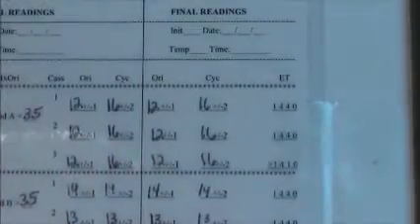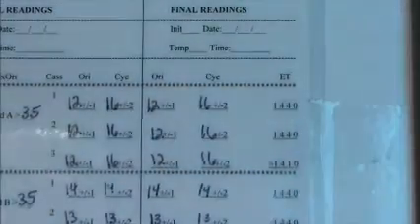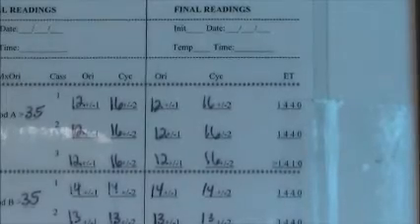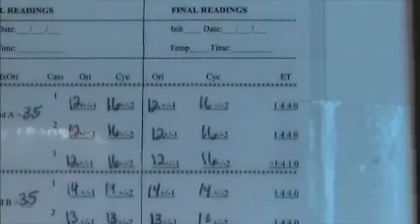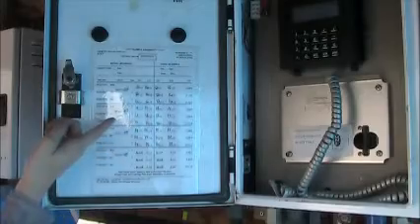Now you can do your final readings. There are 3 values of importance that you will record: ORI, CYC, and ETs. The ORI and CYC values are module specific. Generally, all ORI and CYC readings for a module should be similar. Module specific values should be listed on a sample log sheet taped to the inside of the controller door. If the sample log sheet is missing, please contact AQG staff.